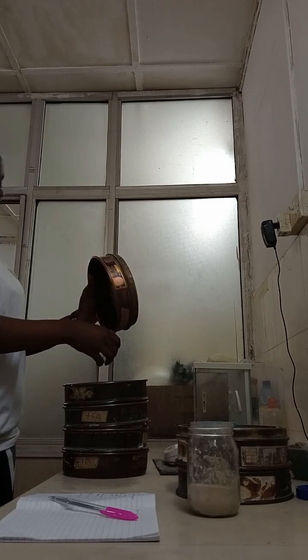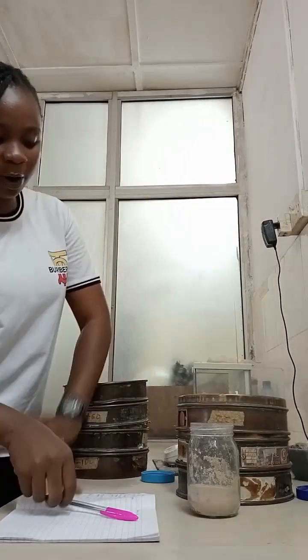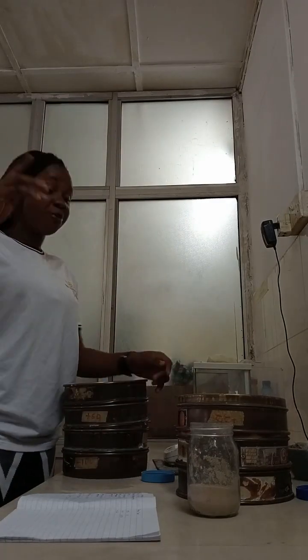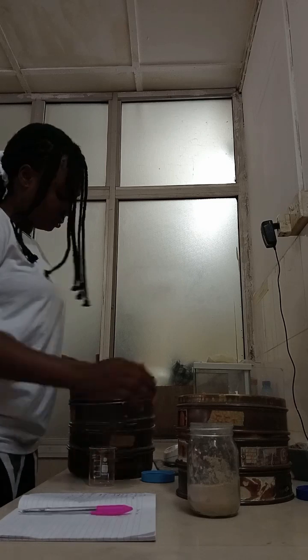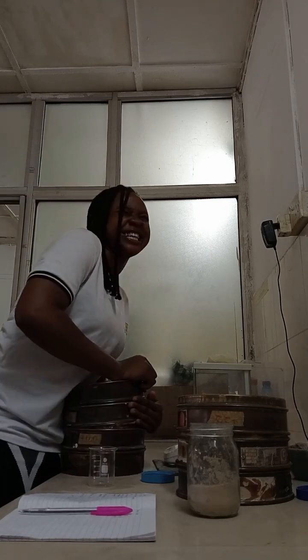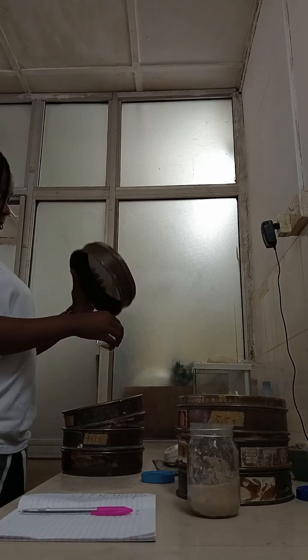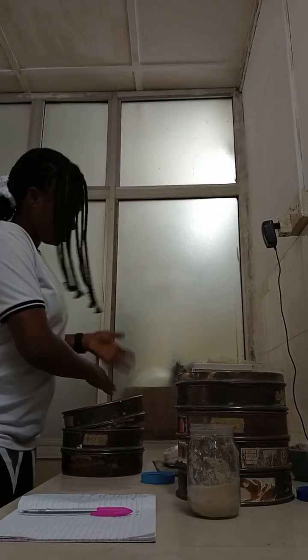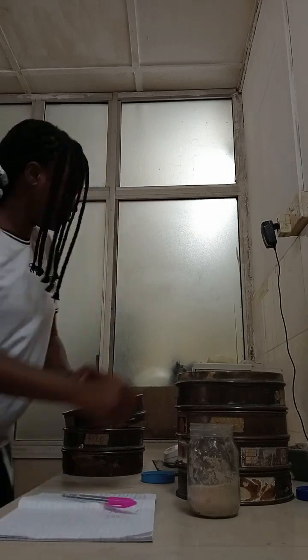Each of these sieves has different sizes. So when they pass through, it's like each grain is passing through, and the one that can pass through, you have to weigh it. This is silica, and silica, which is sand, is one of the raw materials used in producing glass. In doing this silica, we have to do this sieve test. You can do moisture content, you can do the chemical analysis and all that.